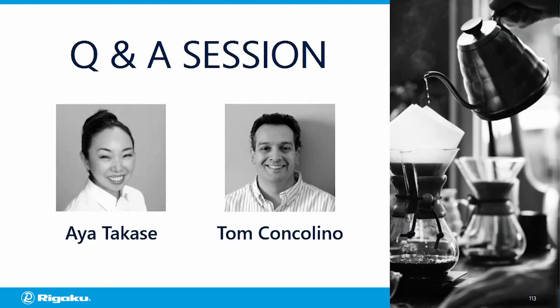All right. This looks like it might be our final question, unless a few more come in. It's from Jeremiah, and he's asking, is there a good resource for comparing X-ray CT beam systems? For example, comparing flat and cone, parallel beam, etc. I'll let you answer that, but I think I know the answer. You can always compare them if you have access to both types of systems.